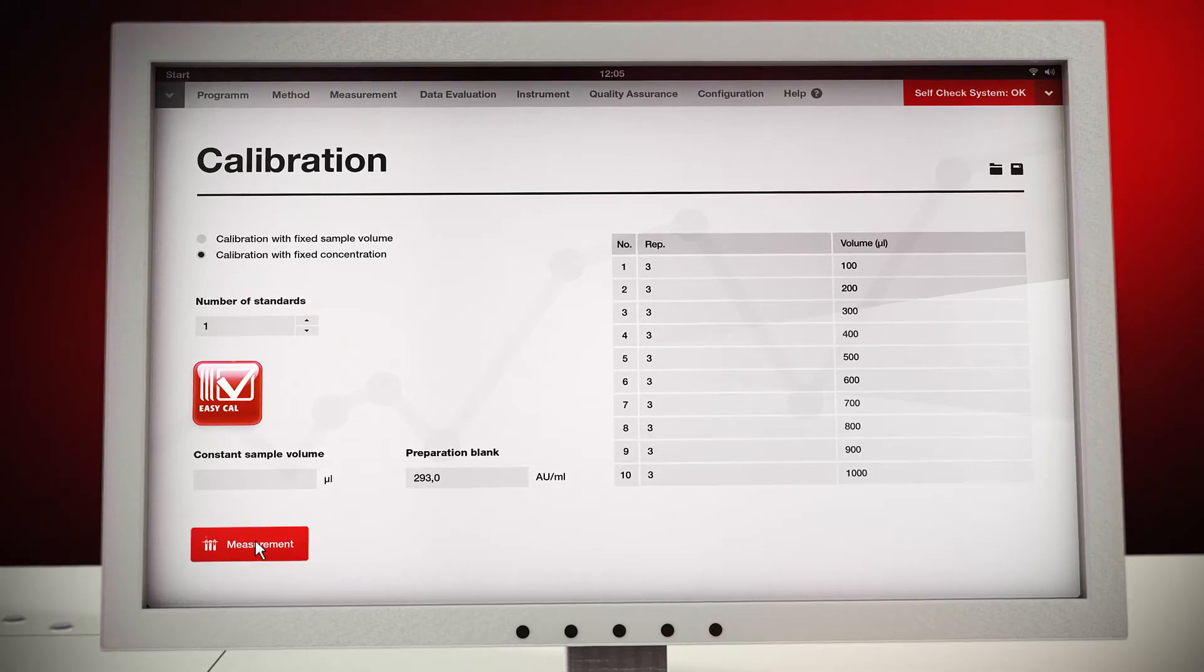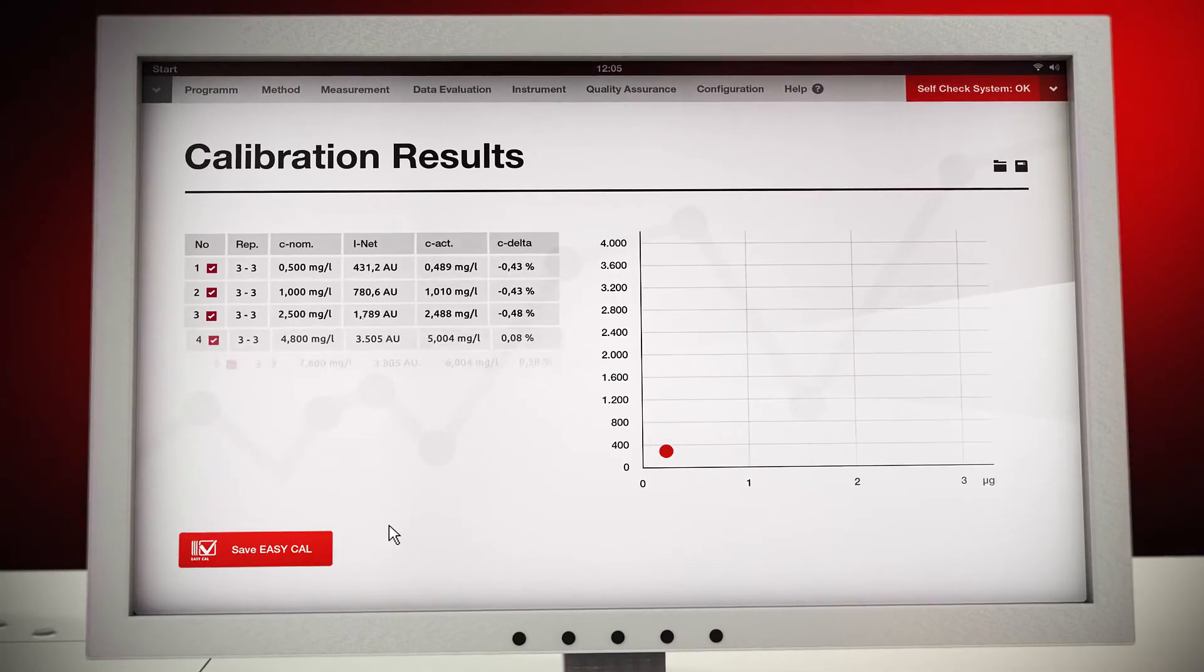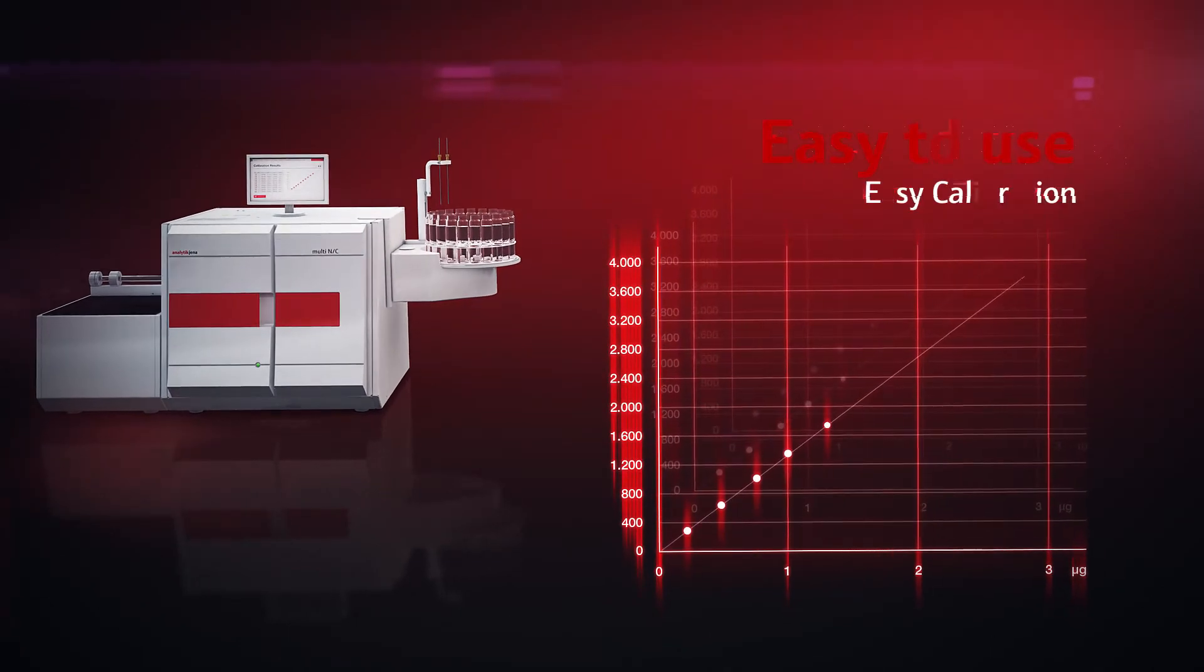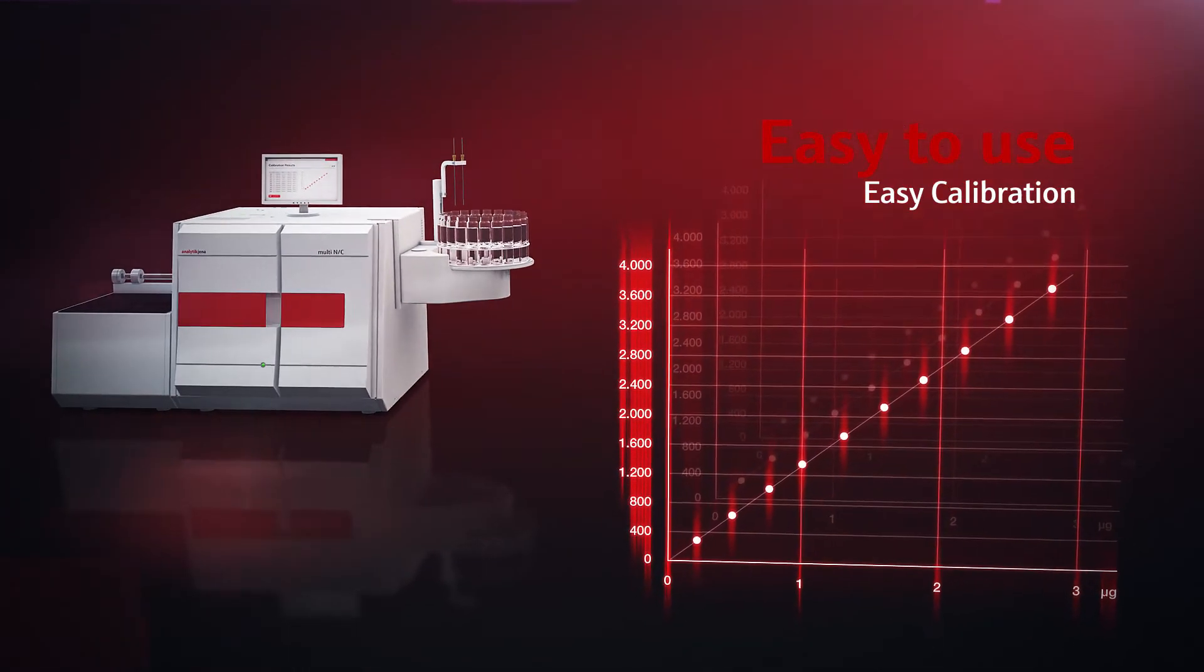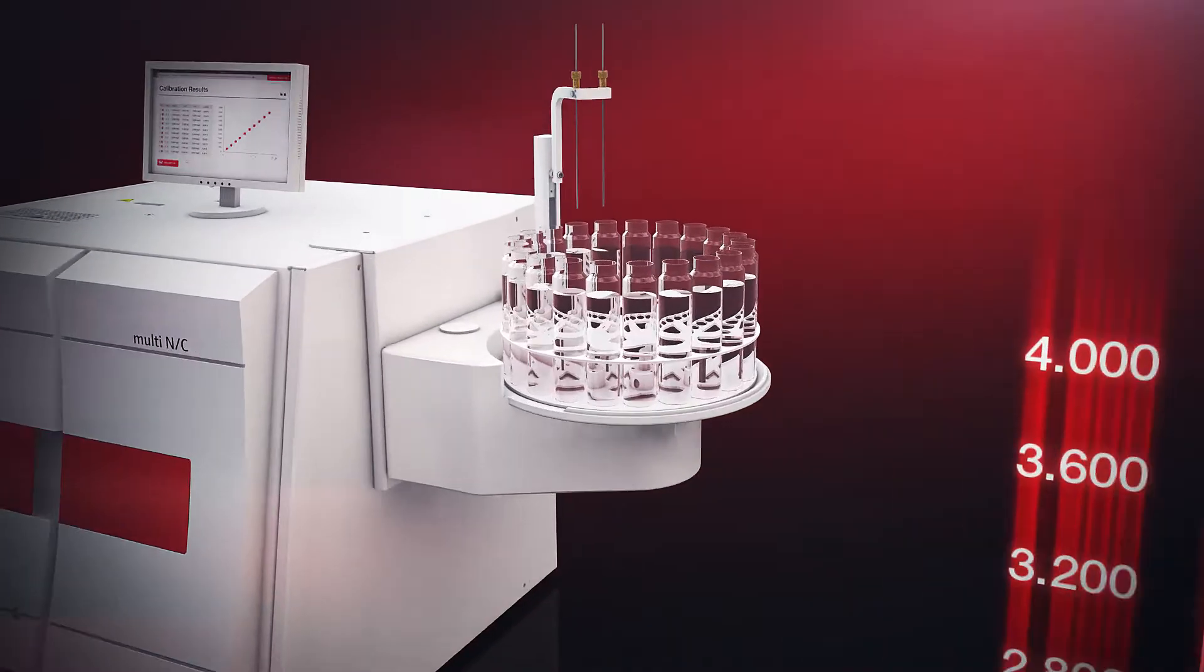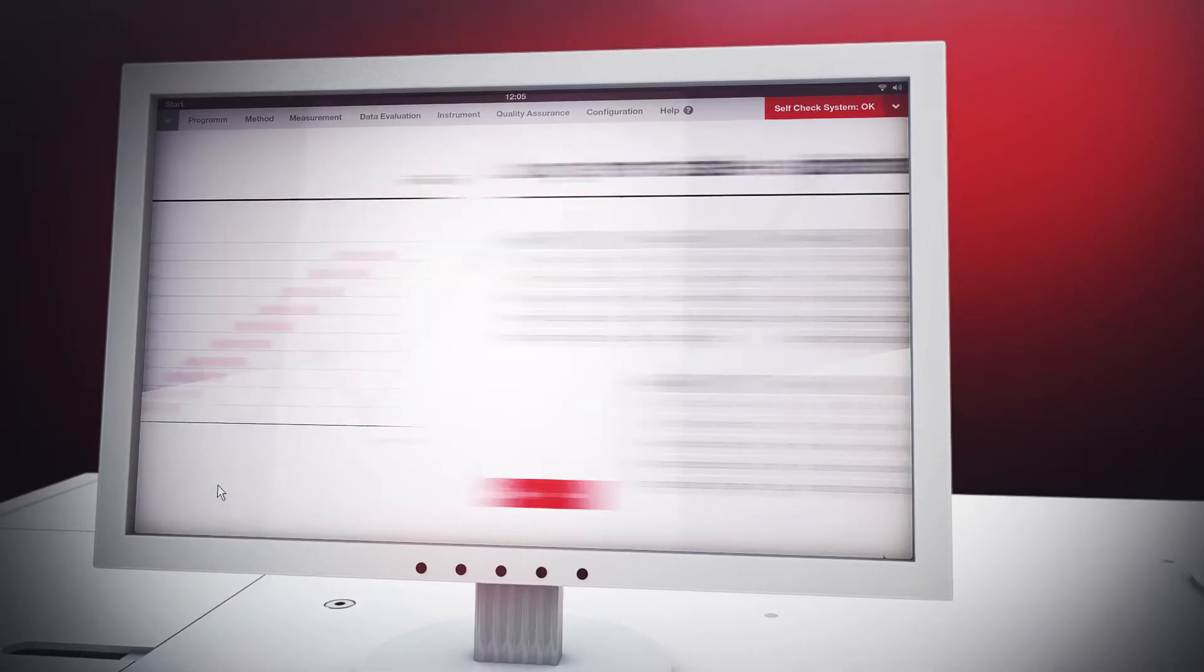EasyCal makes calibration easier than ever before. Software features like single-standard multipoint calibration and automated calibration curve selection allow operating the instrument without expert knowledge.